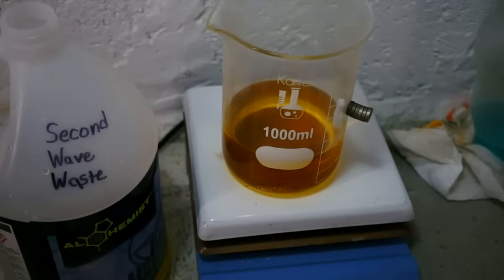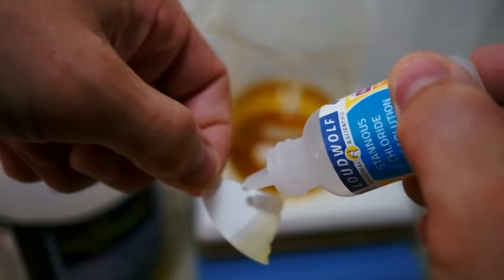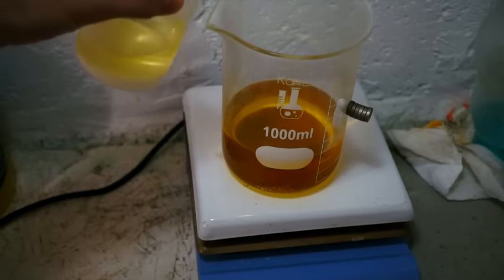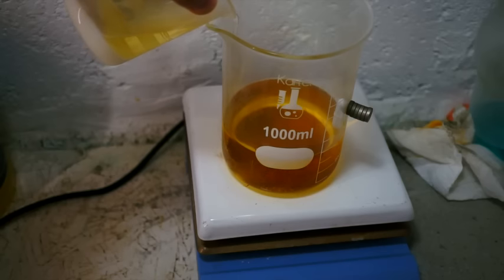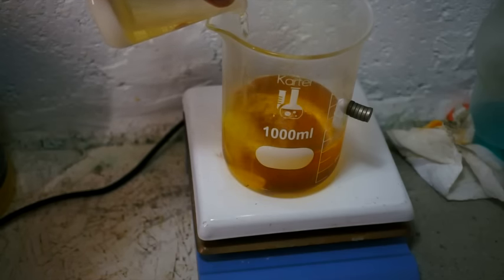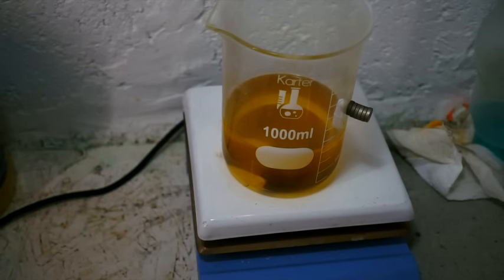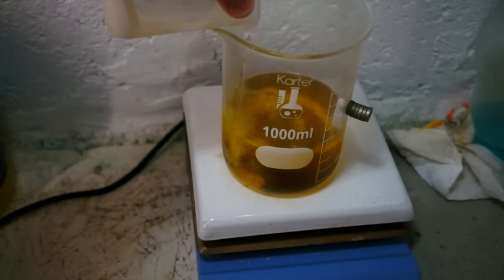After allowing the solution to settle and cool, we will pour it off, but first we will perform a quick stannous chloride test, and it looks like there's gold dissolved in solution. Simply add a small amount of our saturated sodium metabisulfite solution to precipitate the gold out. It is important to add in small amounts and slowly, as we don't want to knock any other metals out of the solution through dilution.